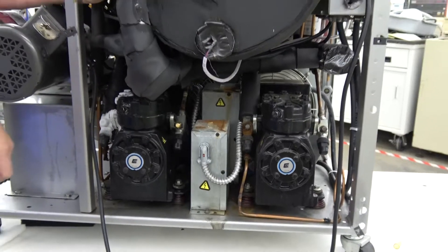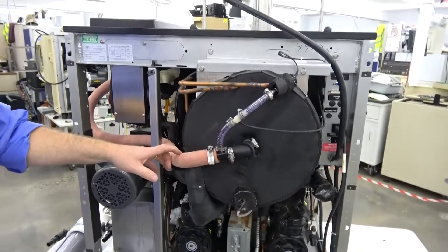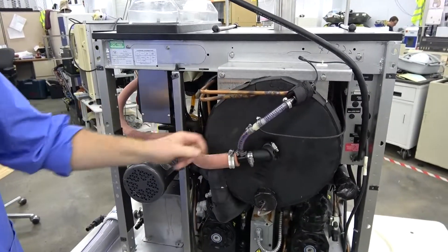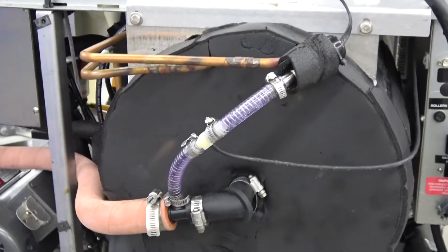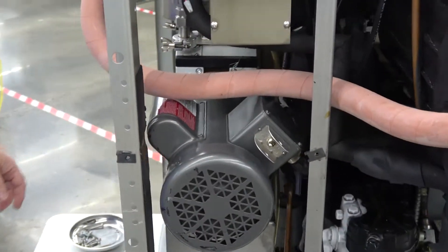Where we had to focus more on this system was the vacuum integrity, so that's why we ended up replacing all the vacuum hoses. You can see the new vacuum lines here going into the vacuum pump. You can see the back of the vacuum pump.